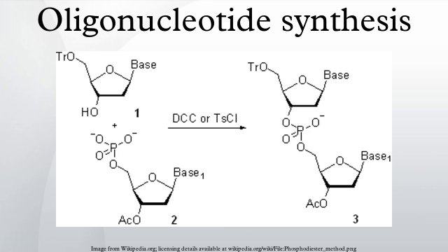To obtain the desired oligonucleotide, the building blocks are sequentially coupled to the growing oligonucleotide chain in the order required by the sequence of the product. The process has been fully automated since the late 1970s. Upon the completion of the chain assembly, the product is released from the solid phase to solution, deprotected, and collected.